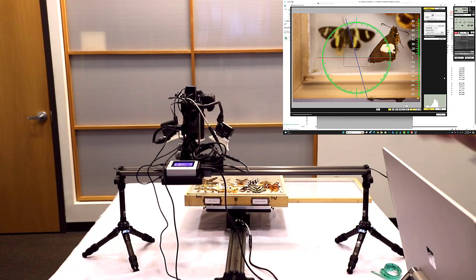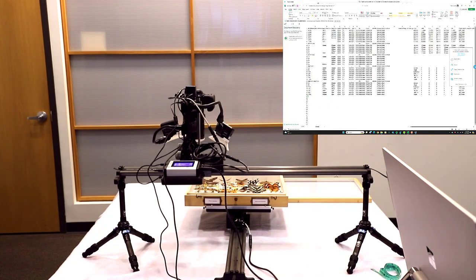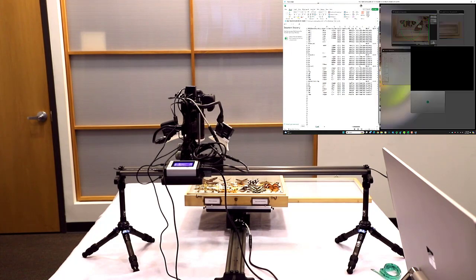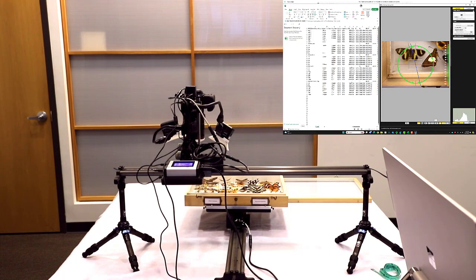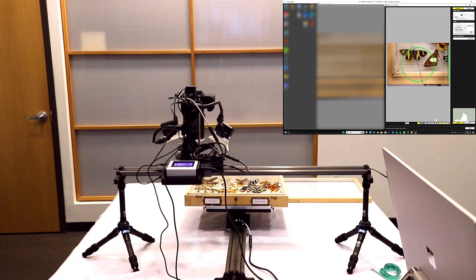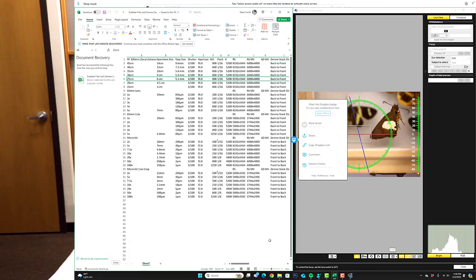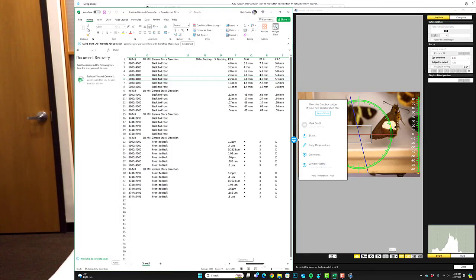Now, the next important part is to just make sure that your overlap, according to that video that we described before, is adequate. So this is where we're going to refer to our table. We know that we're 25 centimeters away from the sample. So I've got my table back here. I'll just kind of minimize it and push it off to the left so we can look at it simultaneously. And then we'll turn on our controller. So, at 25 centimeters, that's this column here with the RF100, we can now pan over to where our slider settings are going to be.